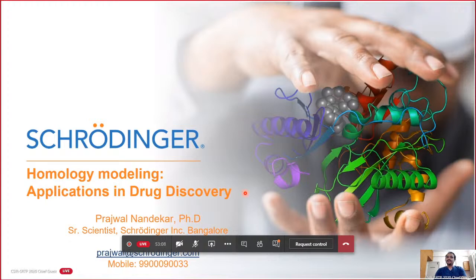I'll be mostly focusing on maybe the same things but with a different aspect, so that you will get the complete picture of homology modeling. And again, it is all template based homology modeling of a protein structure.